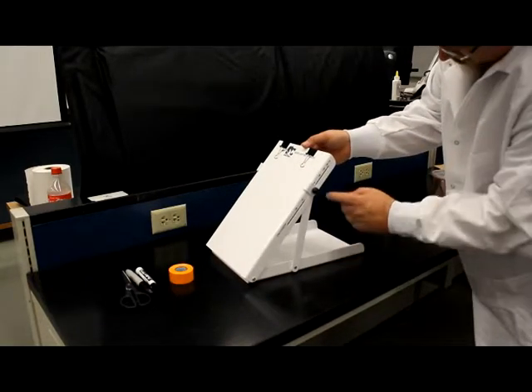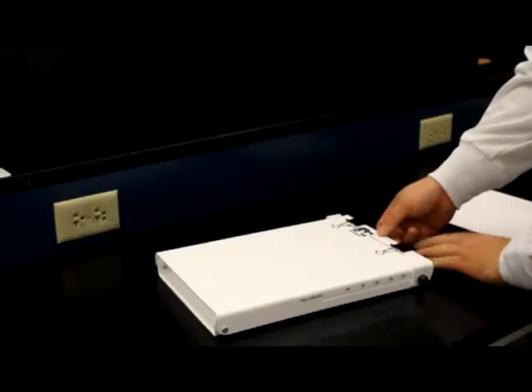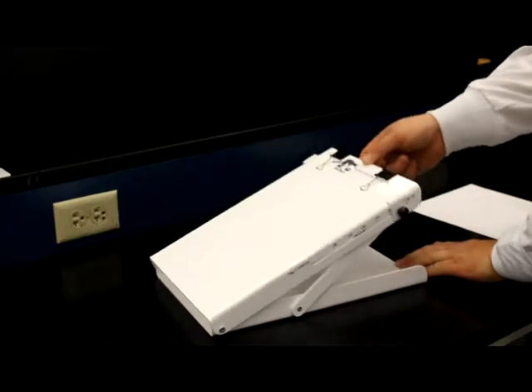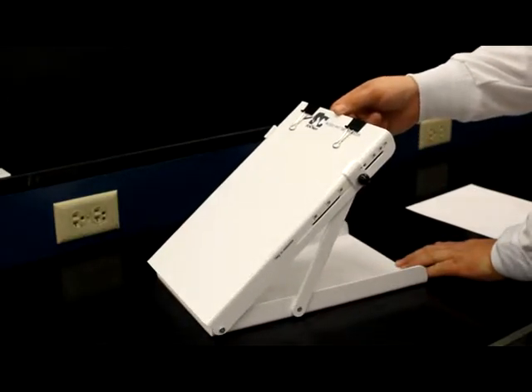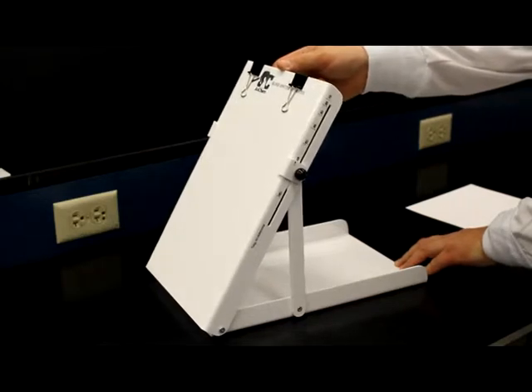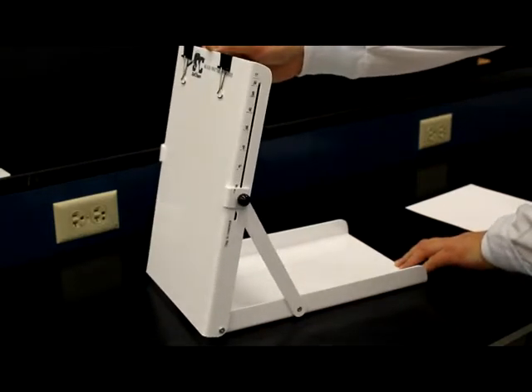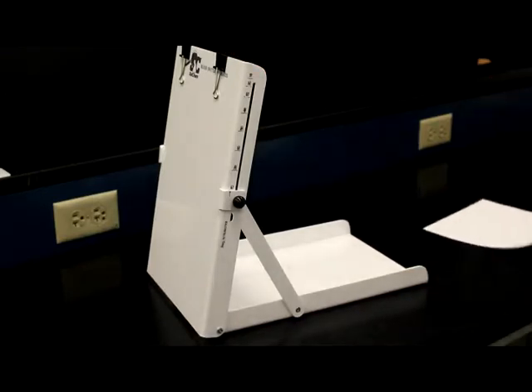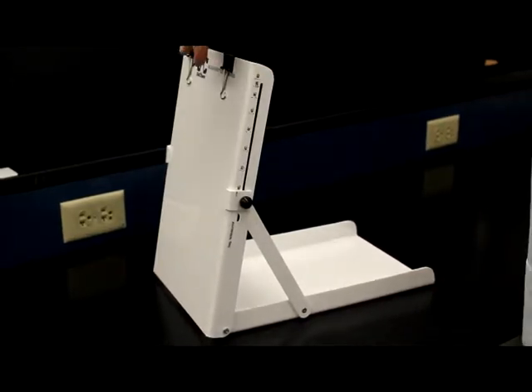For instance, this is a 50-degree angle. So using the scale here on the side, you can actually compute and establish different angles. For instance, this is 40 degrees, whereas this is a 60-degree angle, whereas this is an 80-degree angle. And from there, you can actually set up your paper so that you're dropping your blood at the correct angle.